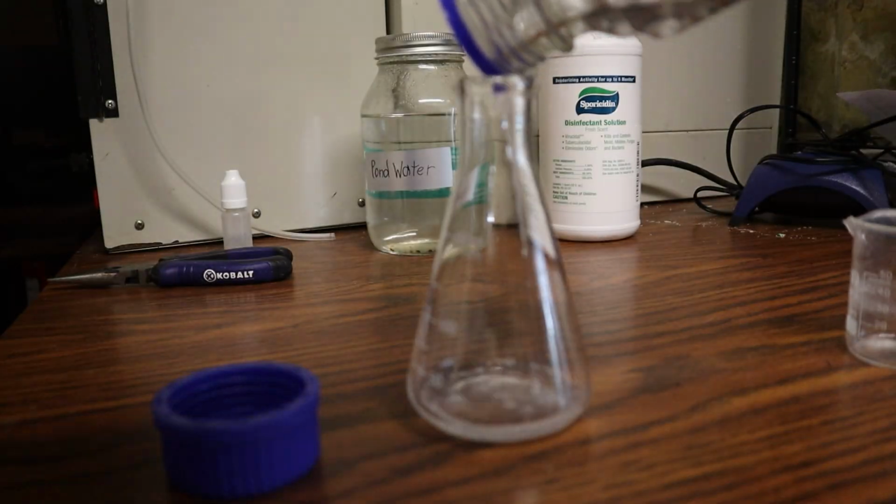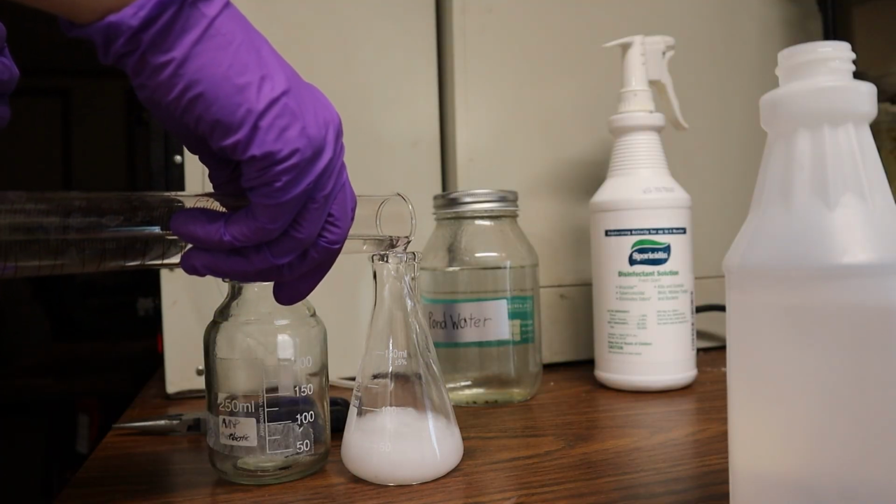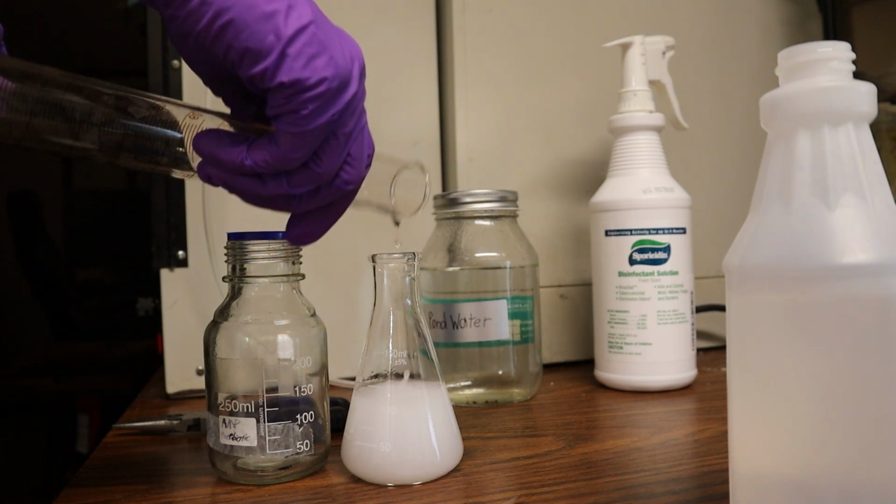The method said to use either acetone or ethanol, and due to how expensive my ethanol was, I decided to use acetone, since it was easier for me to get. After cooling it in the fridge, I poured it into a flask of the 20 mils, and everything immediately turned cloudy. All I needed to do now was filter it off.